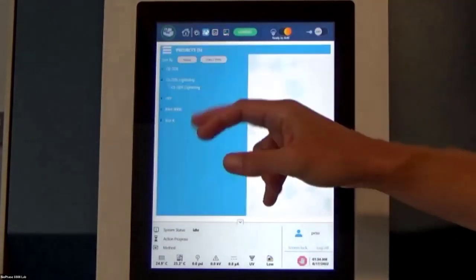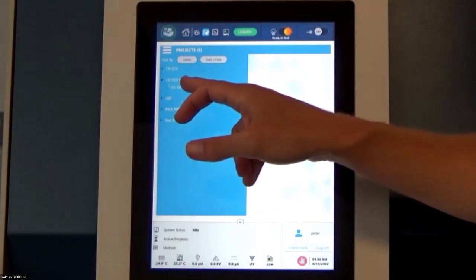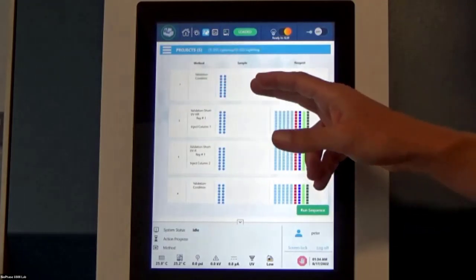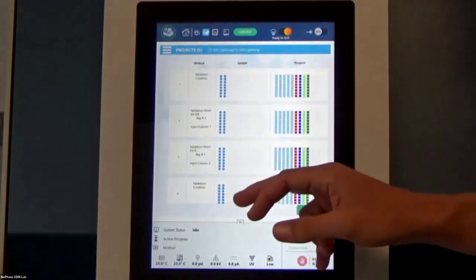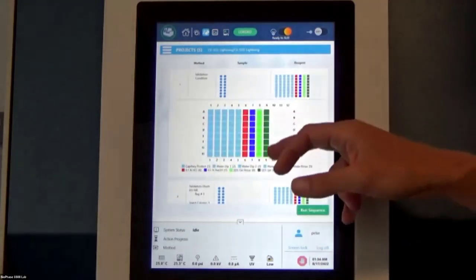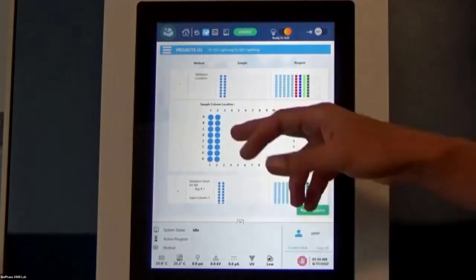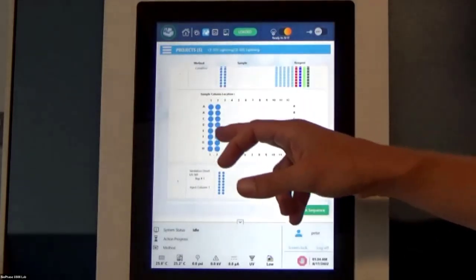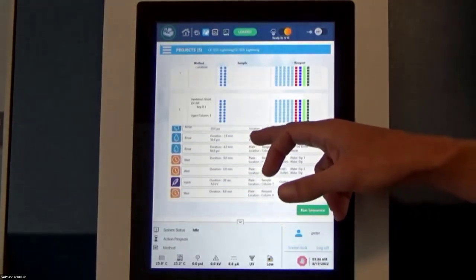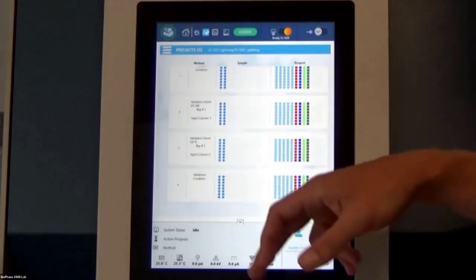So now that it's loaded, we go to run sequence, bring open our Lightning sequence here. I think it's kind of neat. So we've loaded our sequence from our project folder, and we have a lot of different options here as well. If we click on that reagent icon, it'll give us a zoomed view of exactly where your reagents are. If you want to double check, make sure you put everything where it should be. You click on the sample location, it'll show you exactly where your sample should be loaded. You click on your method, for example, it'll show you all of the method parameters. So the rinses, the wait times, where it is, and as it's going, it will tell you what part of that method it's on as well.